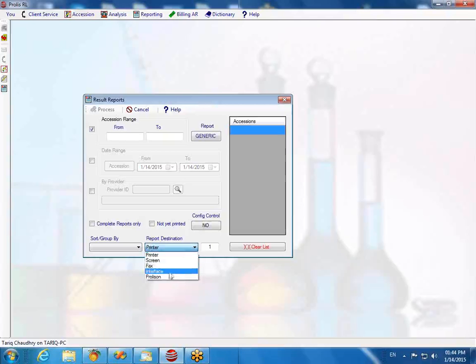We provide you the functionality to push them if you want to, if there is a need. But normally these reports go to the EMR automatically. These reports go to the fax system. We provide you the auto fax also. So if the doctors want you to fax them, these reports go to the fax system automatically as well. And if you get our outreach, which is basically the web portal for your lab, those are published automatically also. Gotcha. Okay.